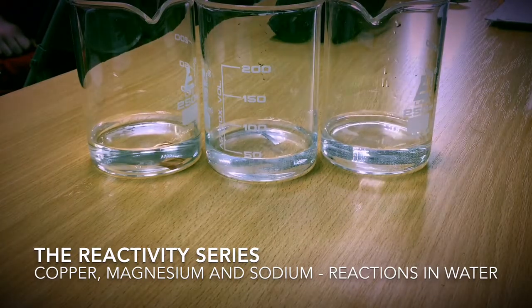Copper clearly exhibits no reaction with water. Similarly, neither does magnesium. However, magnesium will react with steam.